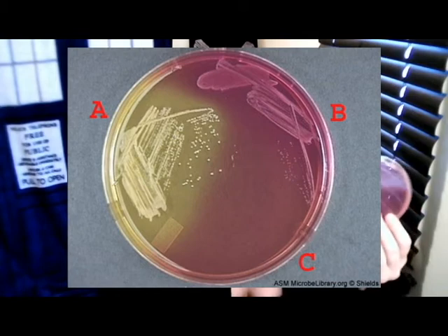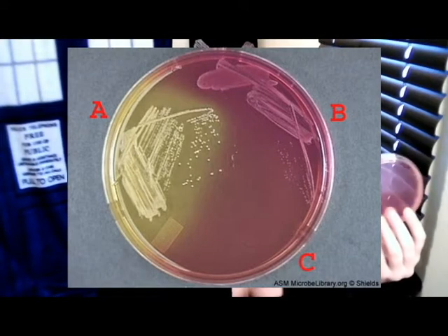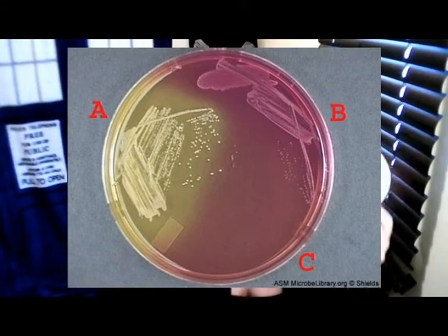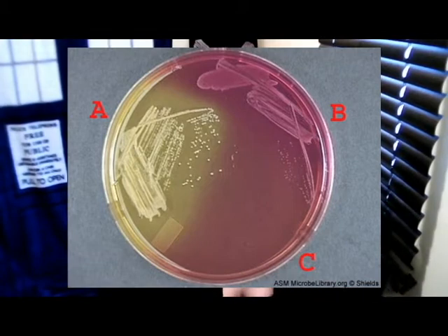However, when a colony doesn't grow at all on the mannitol salt agar, such as E. coli, it's because it's being inhibited by the salt concentrations, so E. coli can't grow at all on here. You could streak this whole plate and all you'll see is your streaking and not the colony growing. So it's able to differentiate between bacteria that can ferment mannitol, cannot ferment mannitol, and colonies that are inhibited by salt.